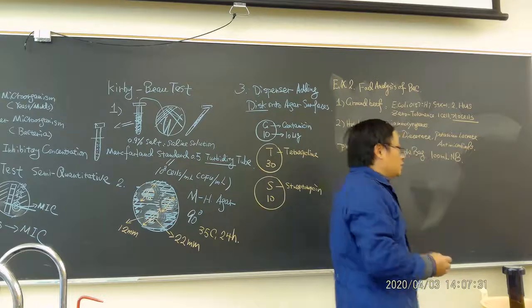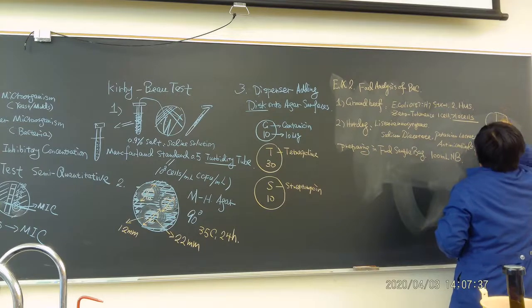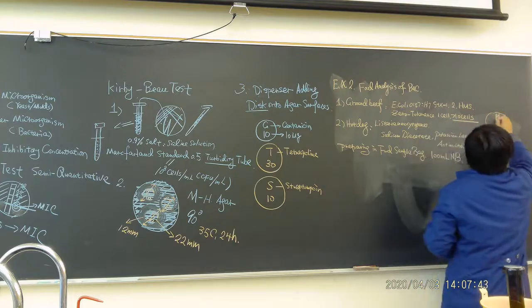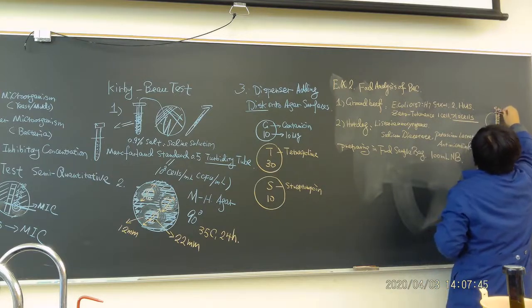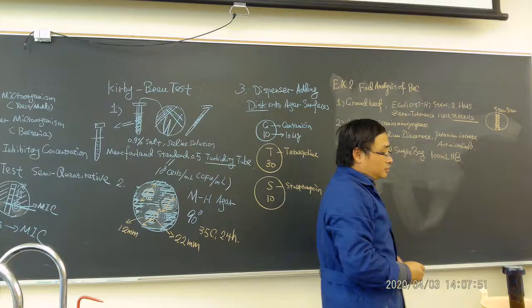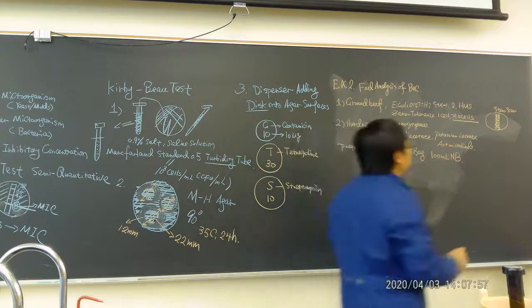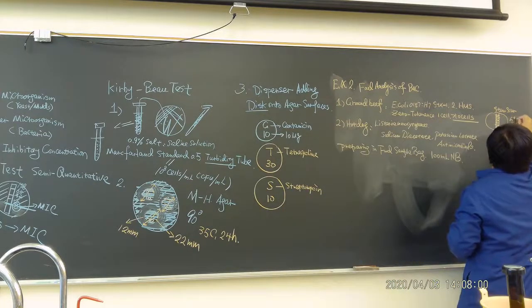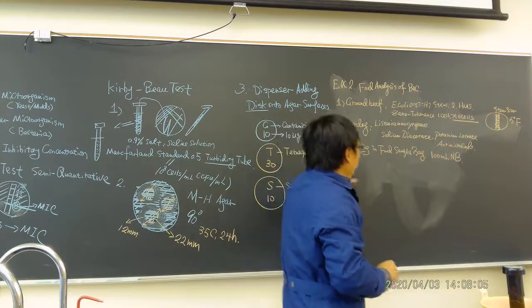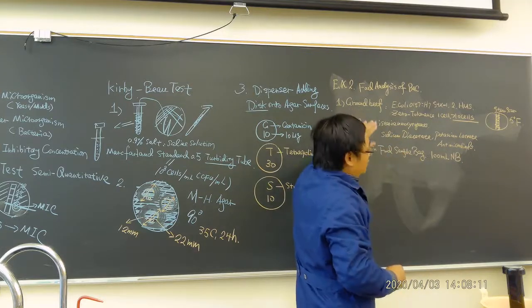For the next lab, we may be doing a tomato. Regarding the tomato, I just want to be very brief. For a tomato, the place where it's easy for bacteria to penetrate is the stem scar. This stem scar area is very easy for bacteria to penetrate inside. So the tomato industry, when they do the washing, has a requirement of 5 degrees Fahrenheit between the wash water temperature and the tomato. Okay, so we just skip that. We're not going to do it today. So we add 100 ml nutrient broth.